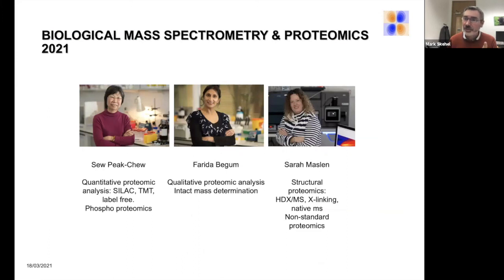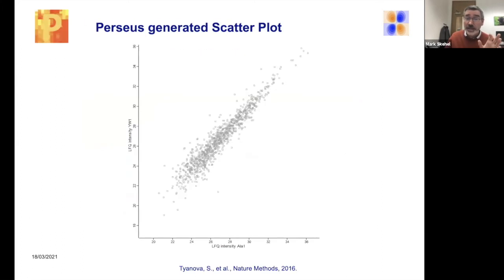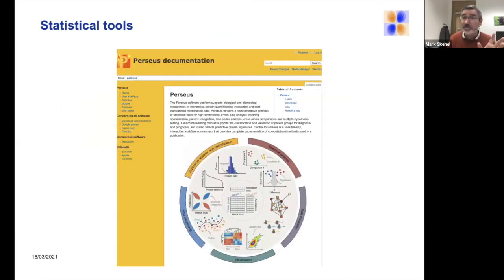There are plenty of tutorials online for Perseus, and there are also tutorials for Scaffold, but you probably don't need as many for that, as that's really just a visualization tool. But if you're going to use Perseus, I would recommend that you look at some of the online tools for how to do things. It's relatively straightforward to import data into this system, but there are then lots of things that you can do within that to tease out what you want to look at.